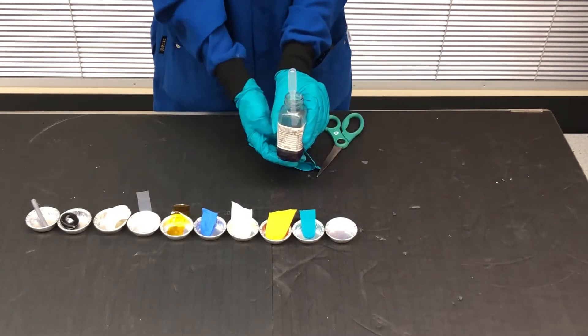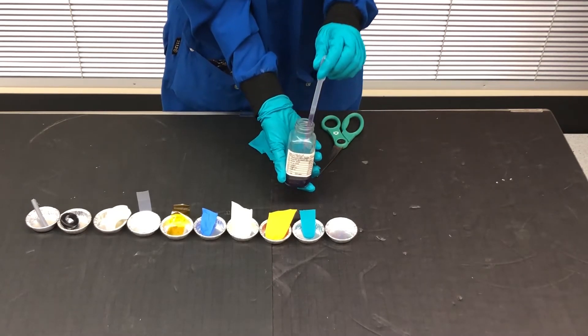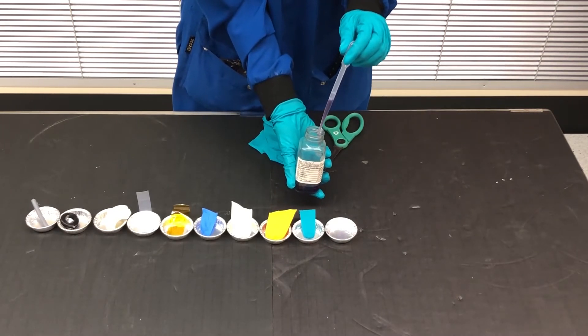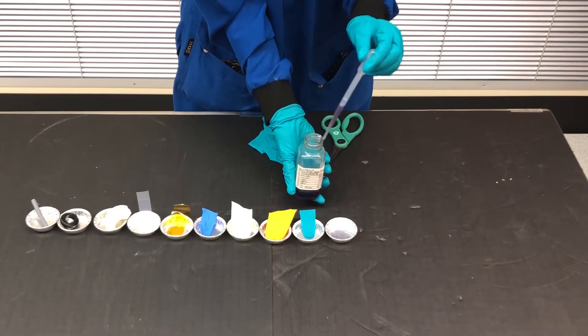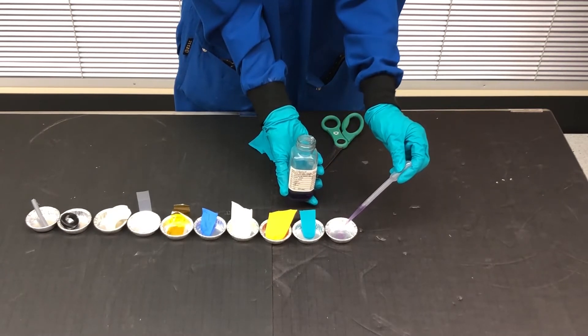For liquid samples, such as oils or lubrication, pipette or pour a small drop into the bottom of the tin for testing. Repeat this procedure for all the other potential sources of contamination.